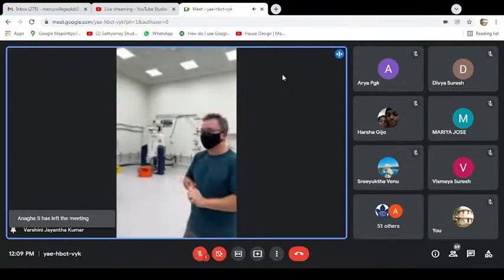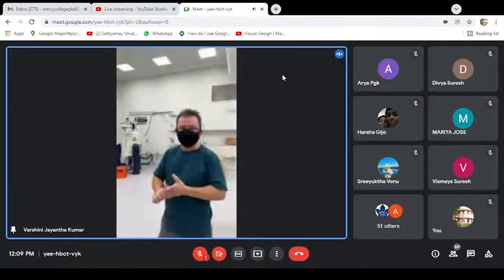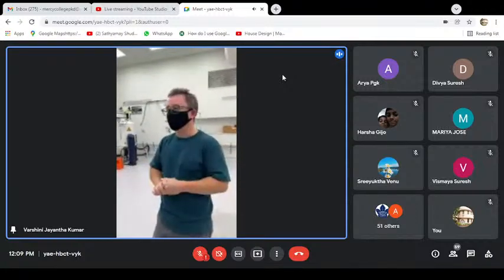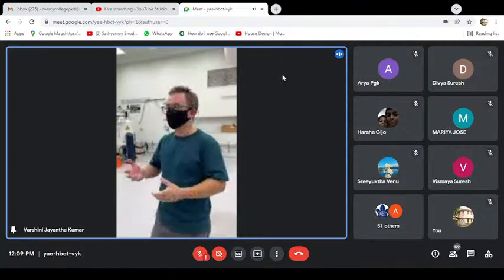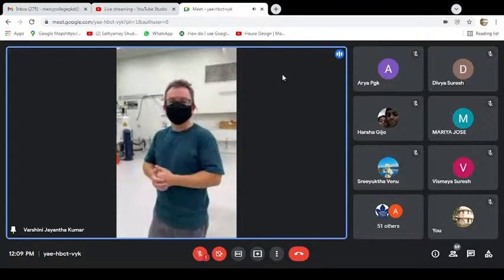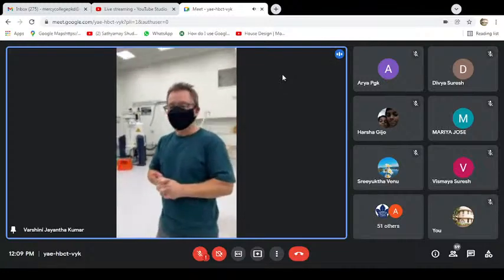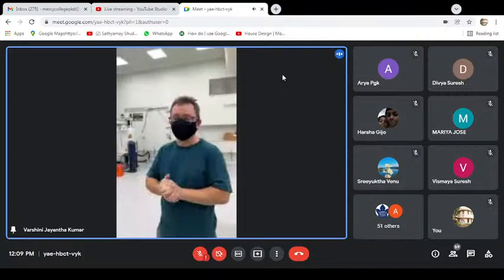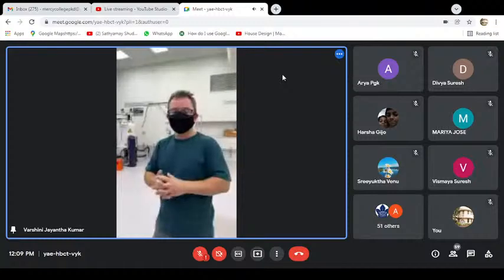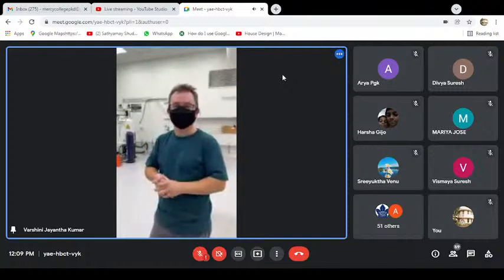Yeah, so all of the users here, the students here, get trained in the use of the instrumentation, and then when they've got trained, they're allowed to use the machines themselves, and they come and do the research, and I help them when needed, and try and offer a helping hand. It's used by almost all of the synthetic chemists in this building, for example, and a variety of people from elsewhere in the university and in the other universities and so forth.